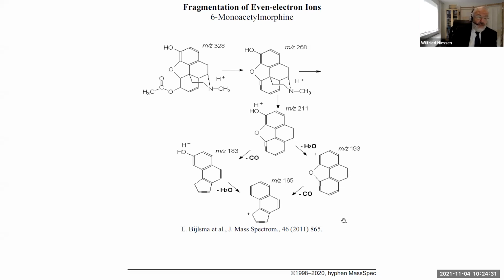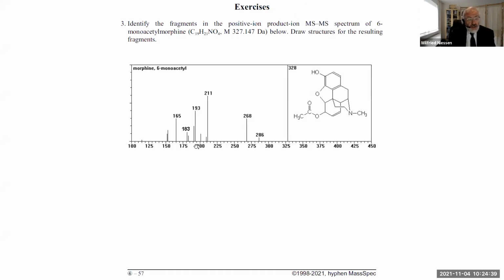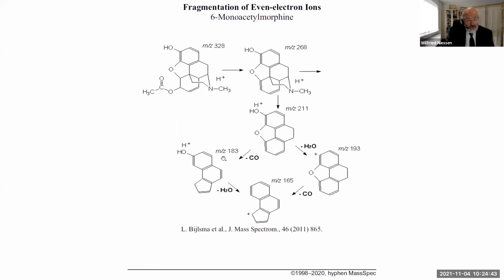But for me, the most important step in the procedure was the loss of the nitrogen ring. And you may have seen in the spectra that I left out some ions because there are some more things going on, but I didn't want to dig into that.